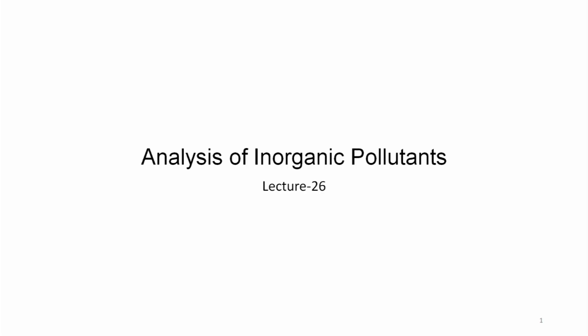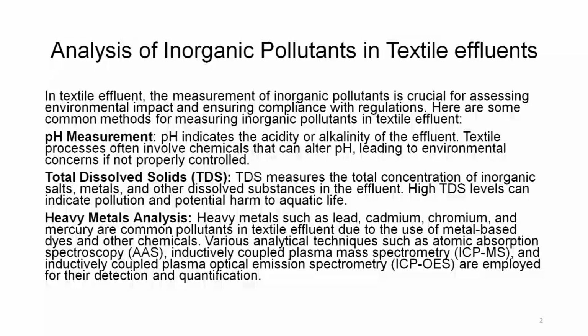Analysis of inorganic pollutants, lecture number 26. Let us now try to see how these inorganic pollutants are analyzed in the textile effluent. In textile effluent, the measurement of inorganic pollutants is crucial for assessing environmental impact and ensuring compliance with regulation. Here are some common methods for measuring inorganic pollutants in textile effluent.